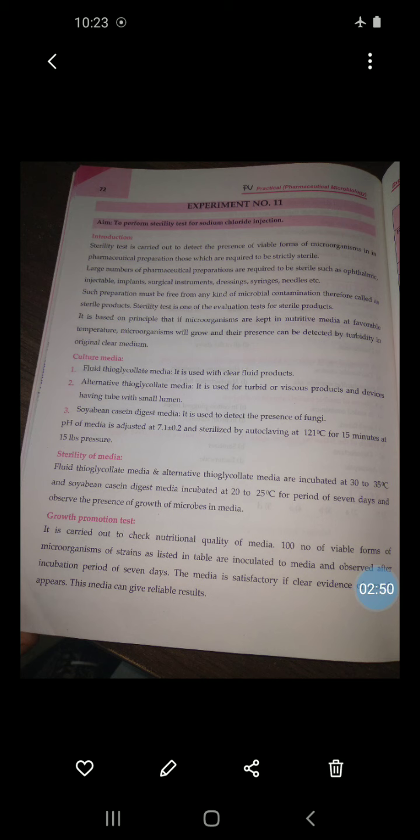The pH of the media is adjusted to 7.1 plus or minus 0.2 and it is sterilized. This means the culture media are sterilized by moist heat sterilization, that is, autoclaving at 121 degrees Celsius for 15 minutes at 15 lbs pressure. Next is the sterility of media.